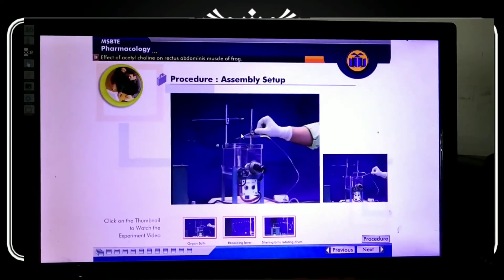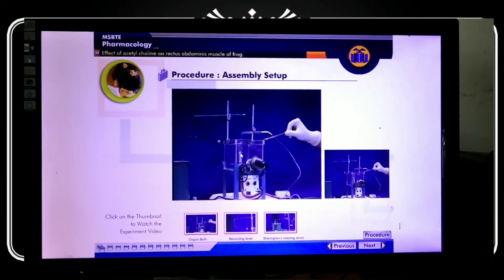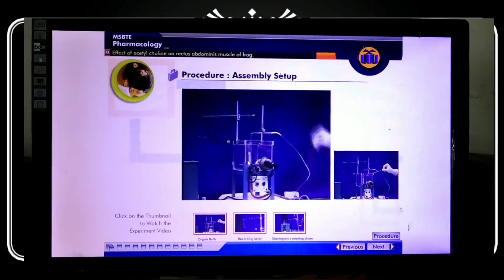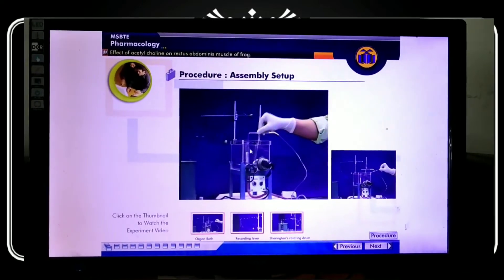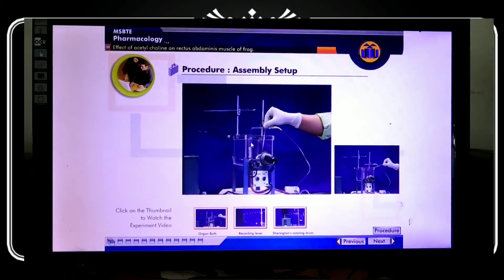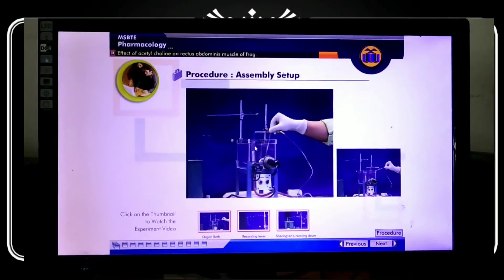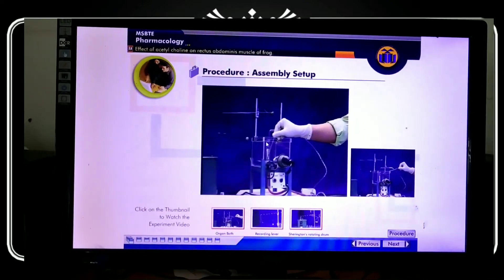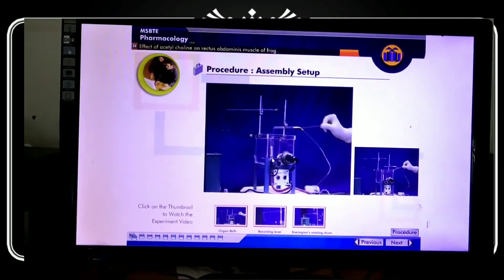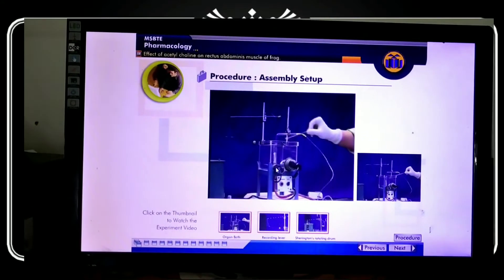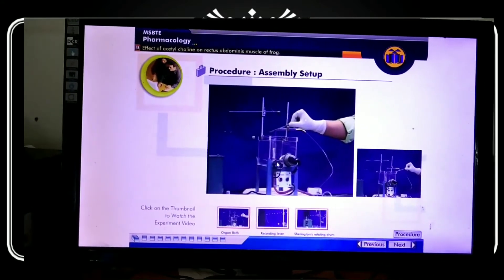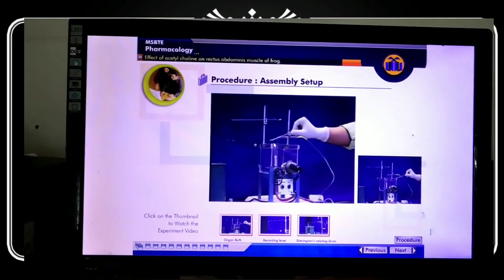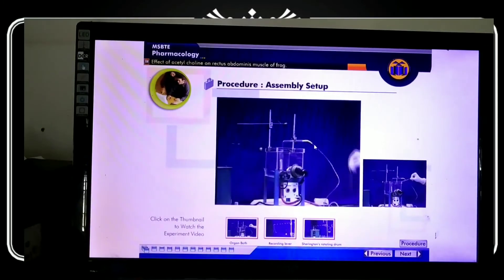A thread is tied to one end of the rectus abdominis muscle. There is a tube for perfusion of Ringer's solution, which is the physiological solution. A tube is placed on the rectus abdominis muscle, and another end of the muscle is tightened with these tubes. An aerator is used to provide oxygen to the rectus abdominis muscle.